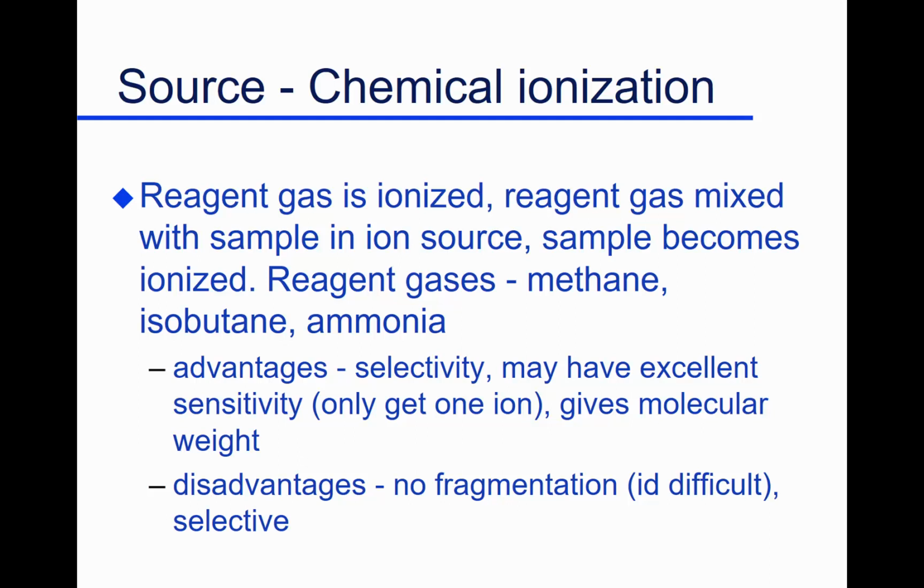But it's a big ion. There's lots of it. It's easy to quantify. So that means I get good sensitivity out of my mass spectrometer. I'm not looking for tons of little pieces. I'm looking for some big peaks. Gives molecular weight, gives me better sensitivity.